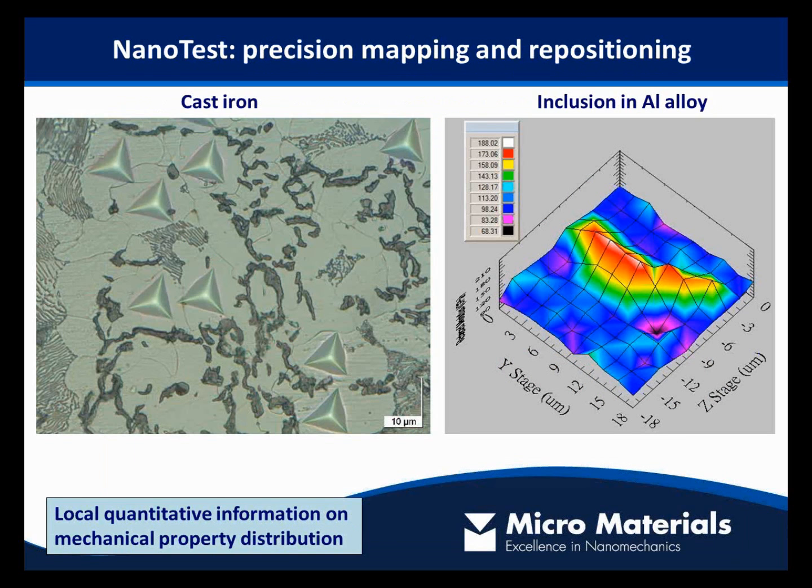So that was determining mechanical properties as a function of depth into materials. As I say, it's also quite often beneficial in heterogeneous samples to look at mechanical properties of different phases. So on the left is an example from France where a customer has been interested in putting indentations at specific phases and avoiding the smaller phases here.